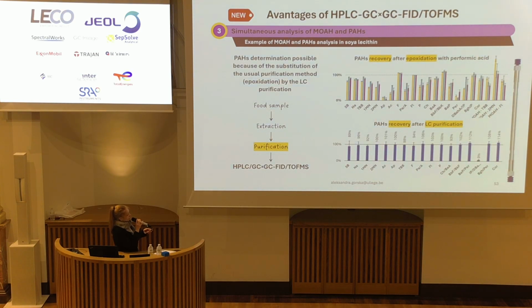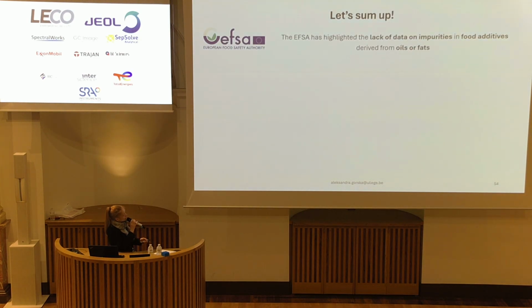Another point I would like to emphasize, we are able to do this simultaneous analysis because we have developed also this purification method with HPLC. So if we were using the usual epoxidation method, we would be losing PAHs, so they are not really properly recovered after this epoxidation procedure, while when we apply this purification using LC, the recovery is much more consistent among all the PAHs. So let's sum up.